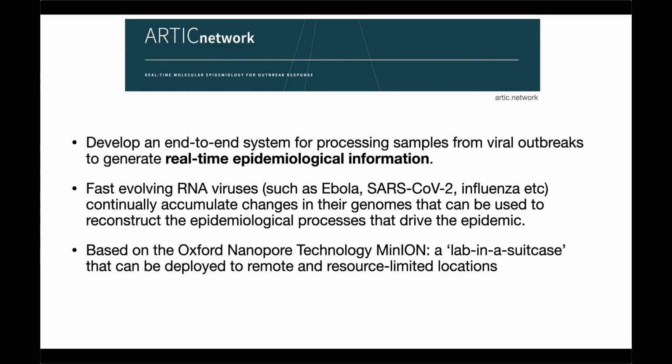But if you have an outbreak in a remote location, say in sub-Saharan Africa or in Southeast Asia or somewhere else, you want to be able to take the instrument to that location and not necessarily wait for the sample to come to a centralized lab somewhere in Europe or the United States or in Asia. So they emphasize portability.